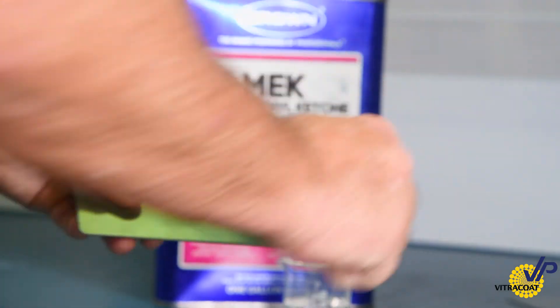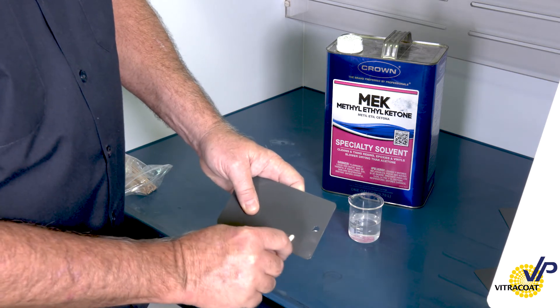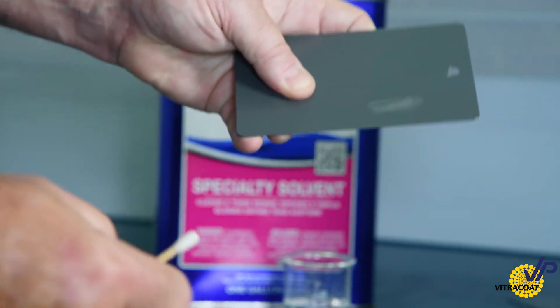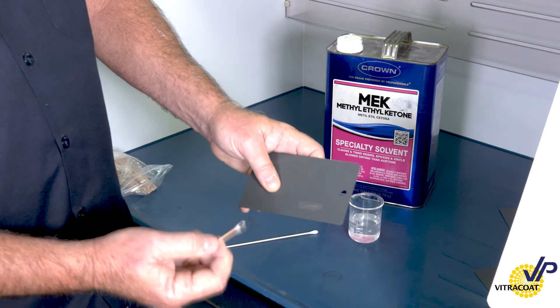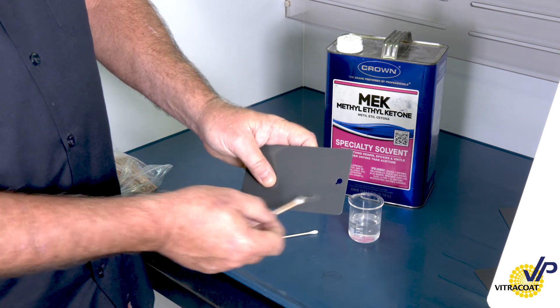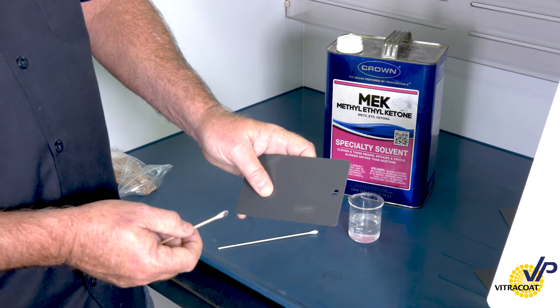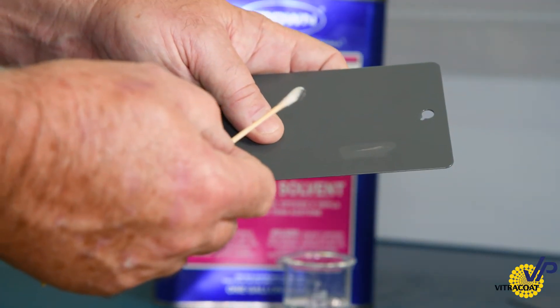Same material and same 25 double rubs. So after just eight double rubs, not only did we get a significant amount of pigment lift, but I was able to get all the way through the coating to the surface — illustrating that this is absolutely not completely cured when compared to a known cure.